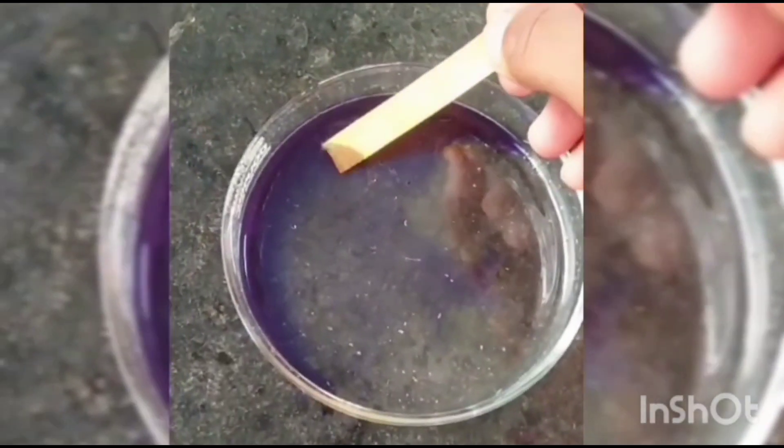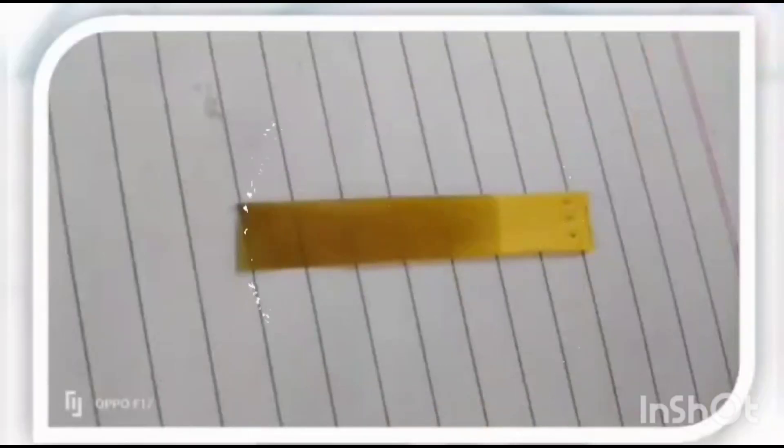Second evaluation test is the determination of pH. The pH range should be 6 to 7, meaning it is neutral.